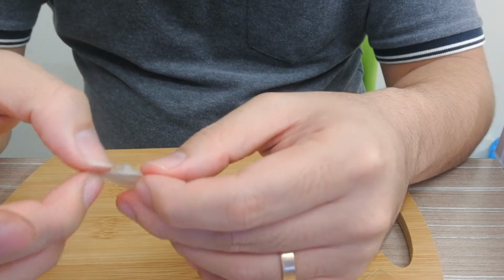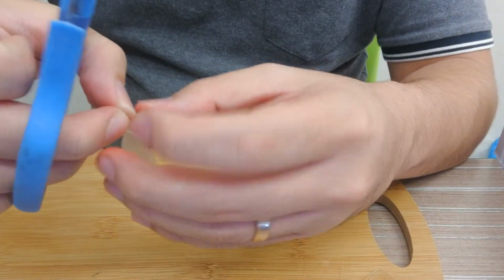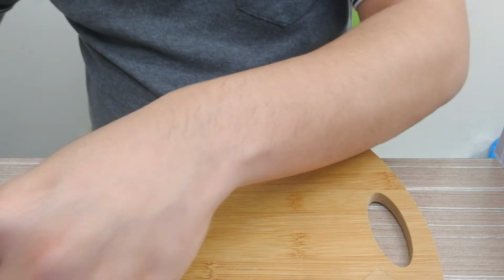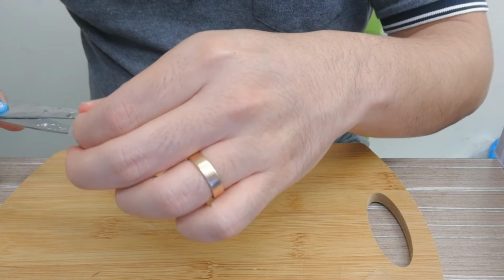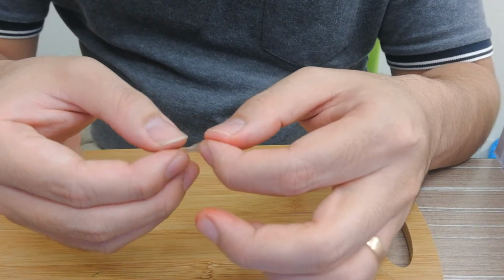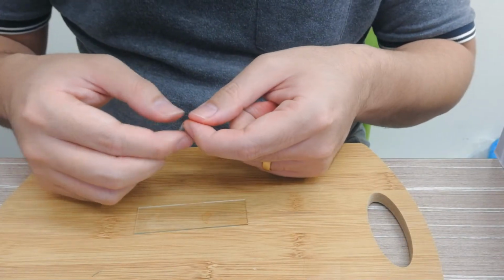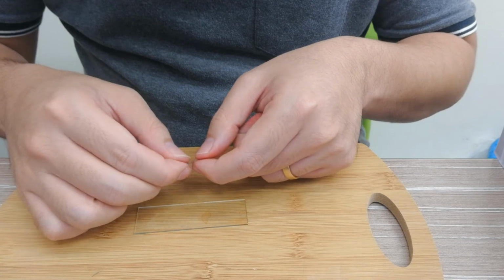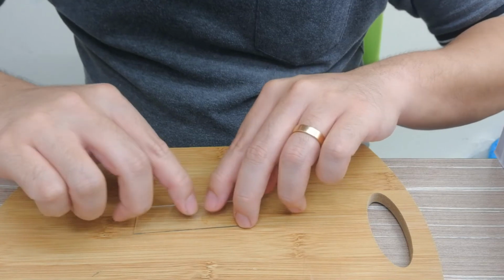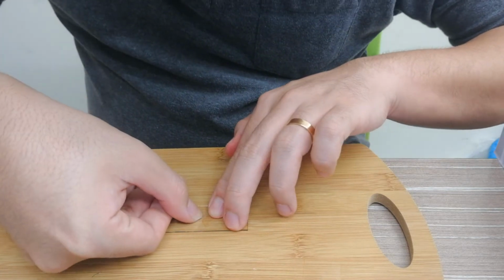Students can share, or if you want, you can ask each of the students to extract it themselves. That will be more fun, I think. Cut smaller pieces. You can use scissors or you can just tear it. Then gently take out this sheet of onion cell and spread it onto the microscope slide. Make sure you spread it open, as wide as possible.